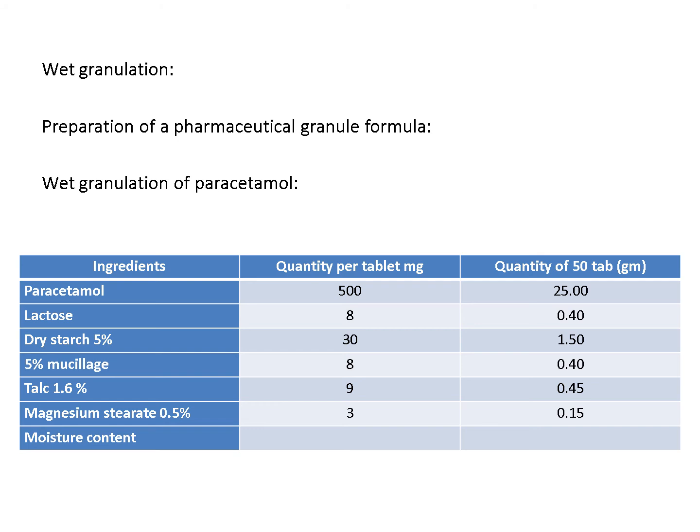If I don't add disintegrants inside the granules, I will transform the formula into a controlled or sustained formula. This is an idea, but we will divide it into two halves. As I said, we will use the wet granulation technique, so we will form a 5% mucilage glue binding liquid by adding the powder into water and forming mucilage. That is explained in the practical part.